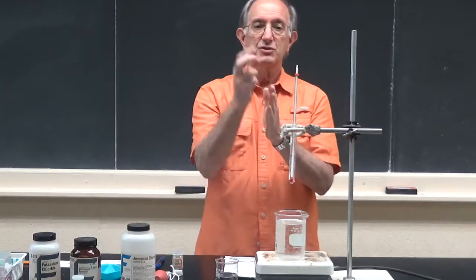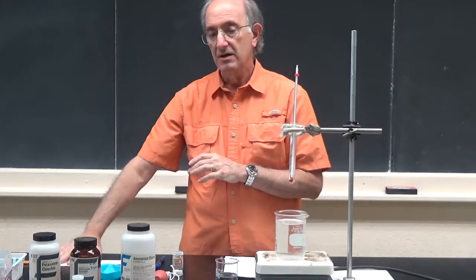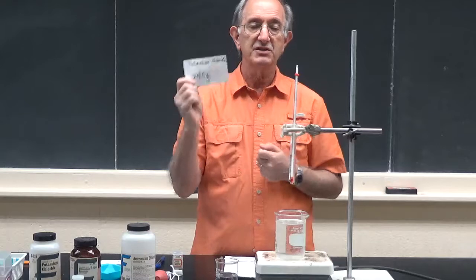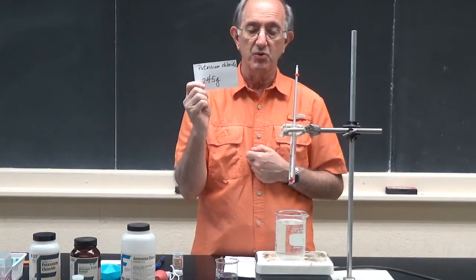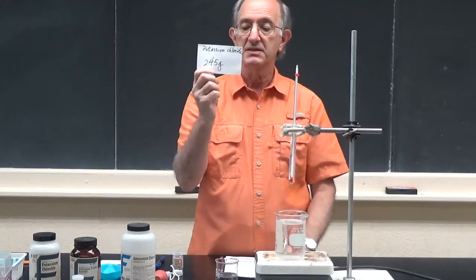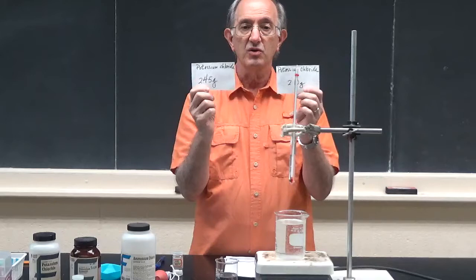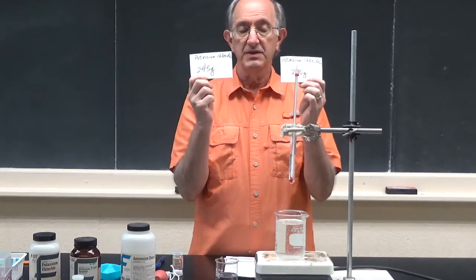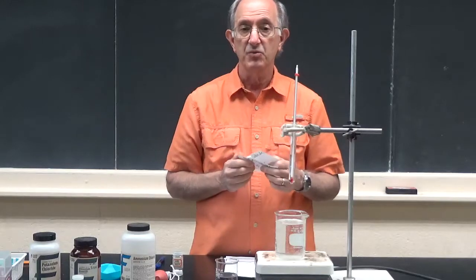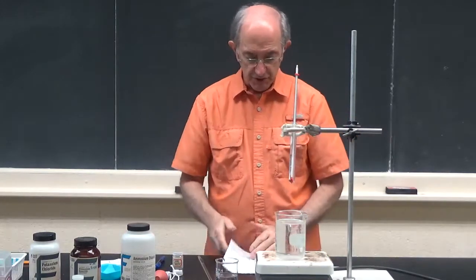So, what do we do with this data? You have 2 data points. Okay? The person that you're sharing data with is going to have an additional 2 data points. This time 5 and 6 milliliters, but containing a different mass than you started with. So the combination of your data will give you 4 data points that you'll use. Okay, so this is what we're going to do.